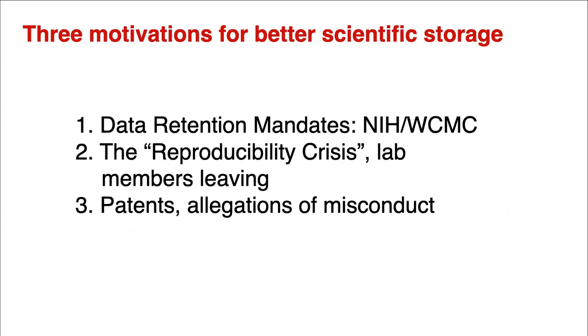or other things to make sure that you're sharing with somebody who has permission to access those PHI. Okay, why do you want to use LabArchive? There are three major reasons, I would say. The first and most important, particularly recently, is that it helps you with your data retention mandates, both the NIH policy and WCMC policy. So if you store your data in LabArchive, you are complying with both the NIH and the WCMC policies, and you just have to tell the NIH or Weill Cornell that you're keeping the data in your LabArchive notebooks.